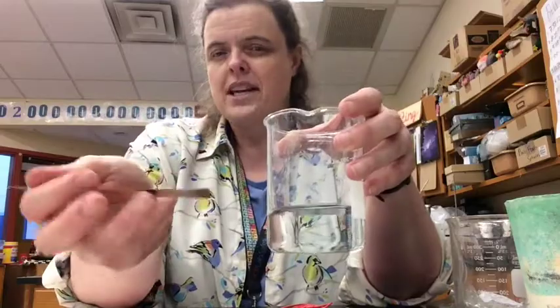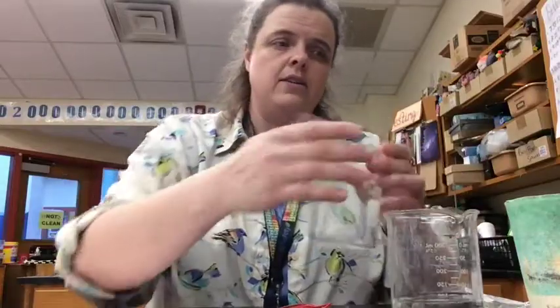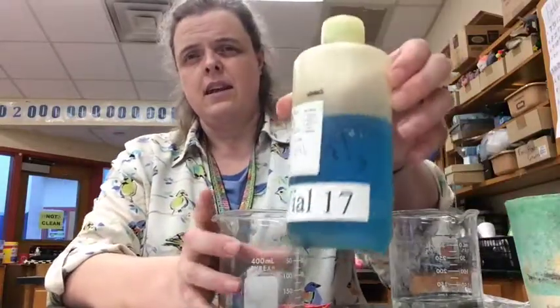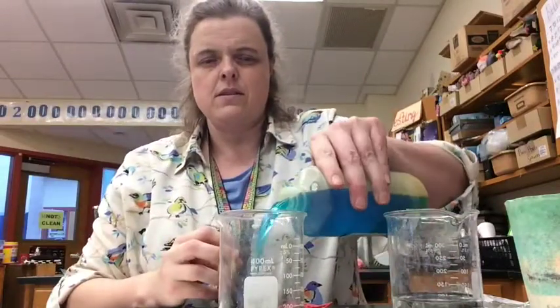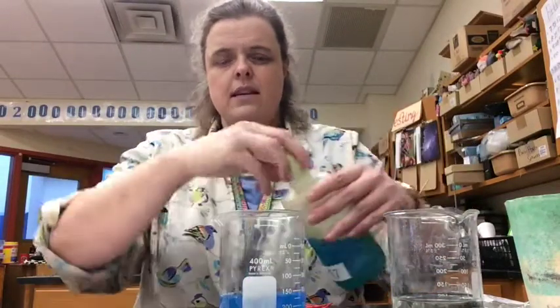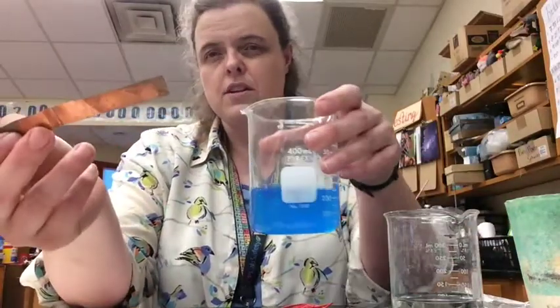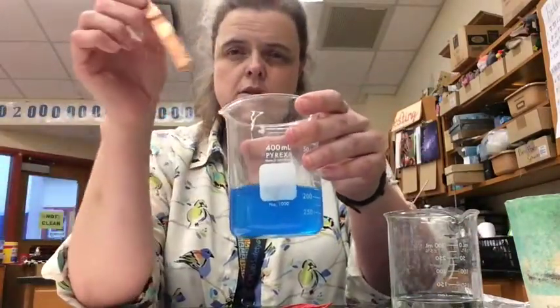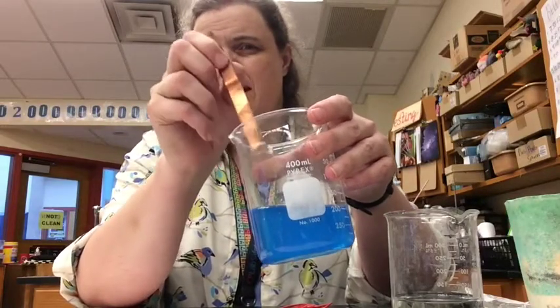Copper is lower on table J. Copper is less reactive. There's no reason it would oxidize. However, if instead of using zinc ions, I use copper ions, any blue solution in chemistry is probably going to have copper ions in it, transition elements. So here's our copper ions. Now, if I take a piece of copper that has no charge, here's our copper ions that are +2. I put that in there. That shouldn't do anything. That's not going to react at all.